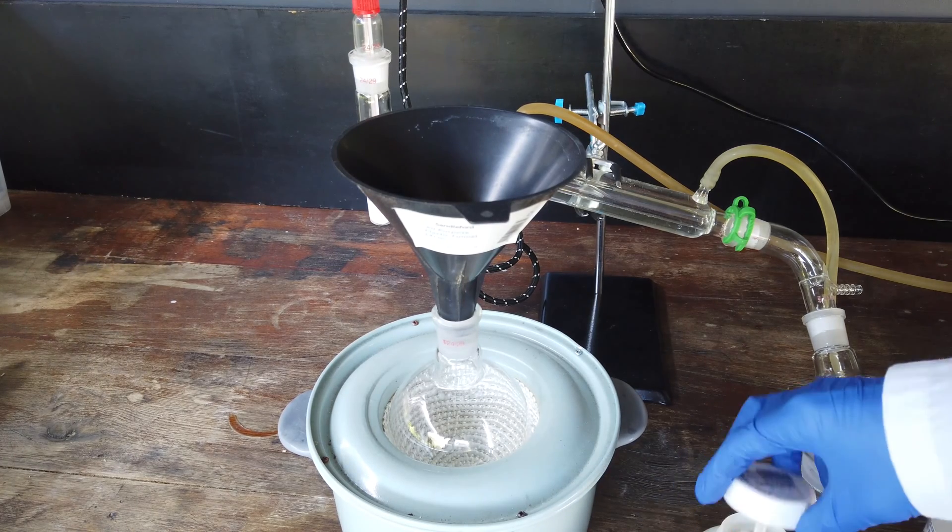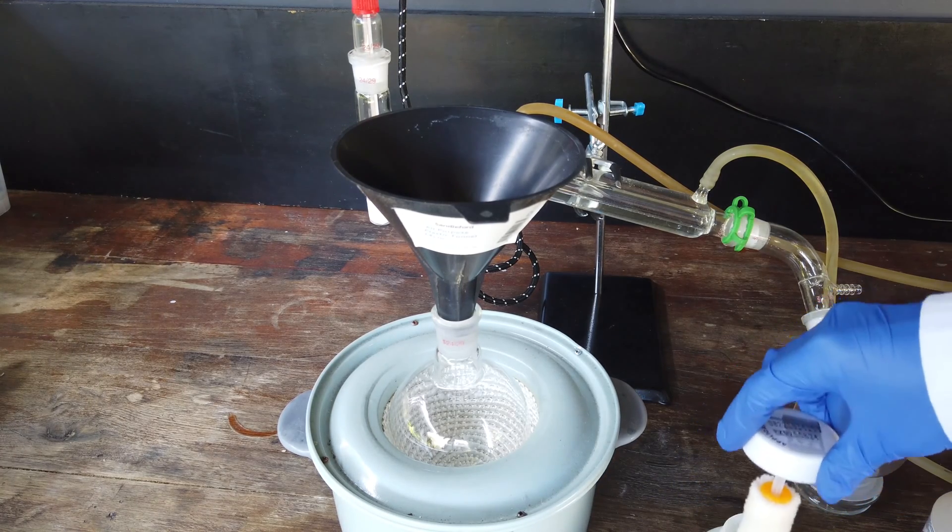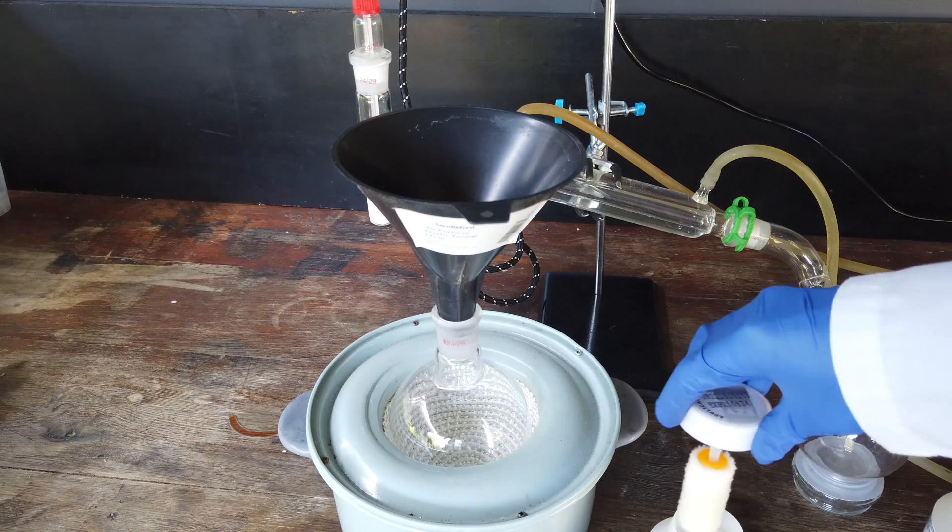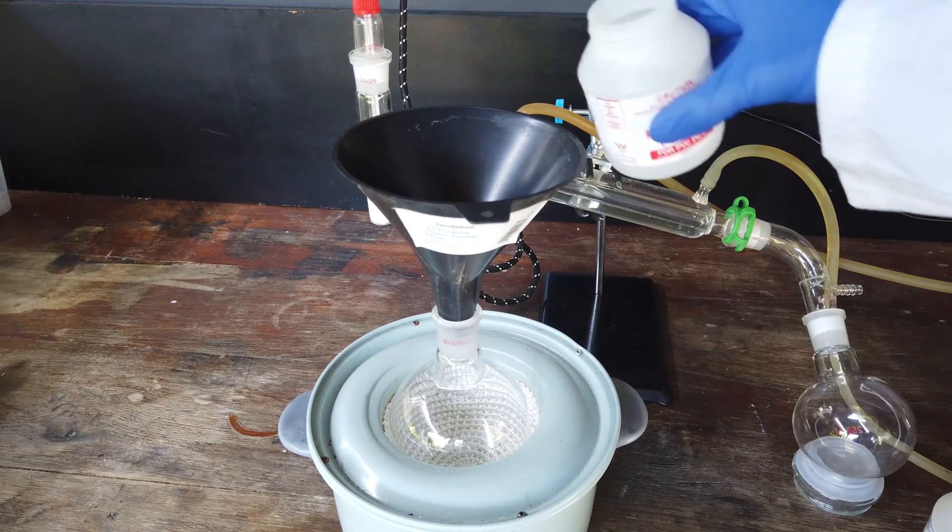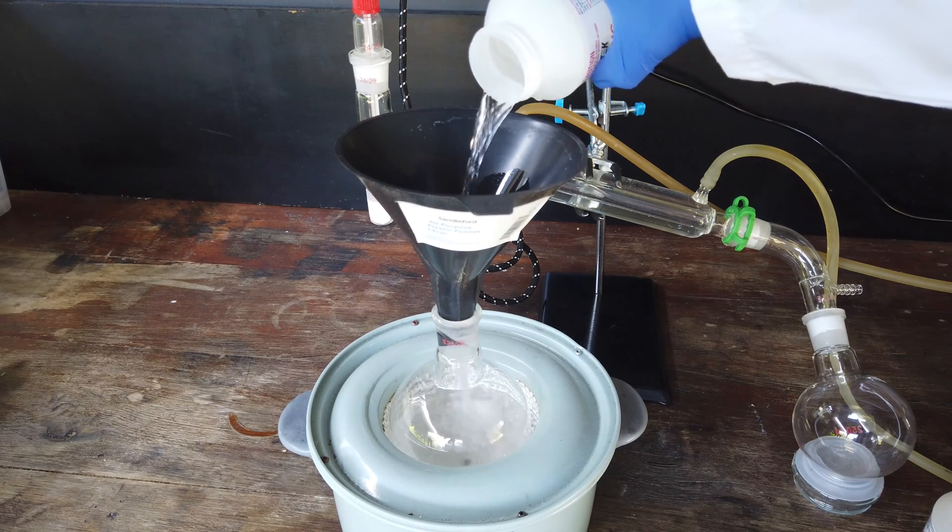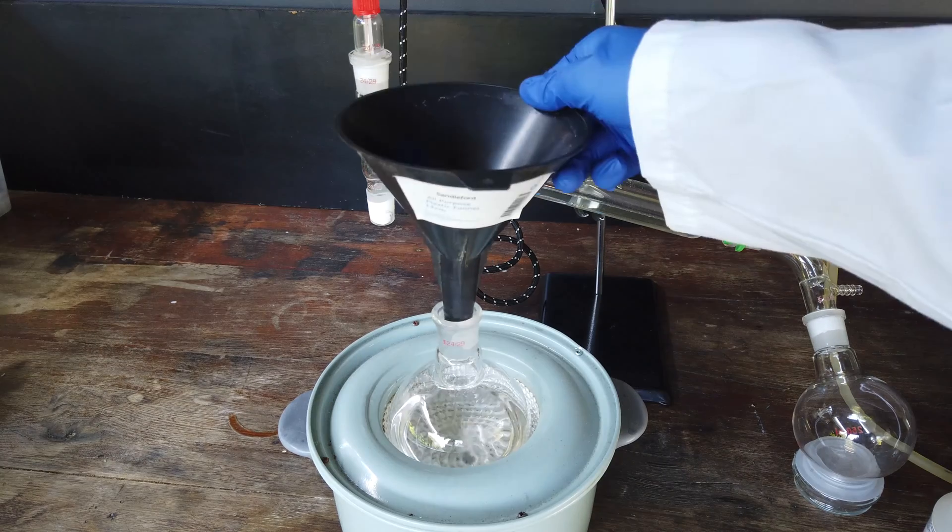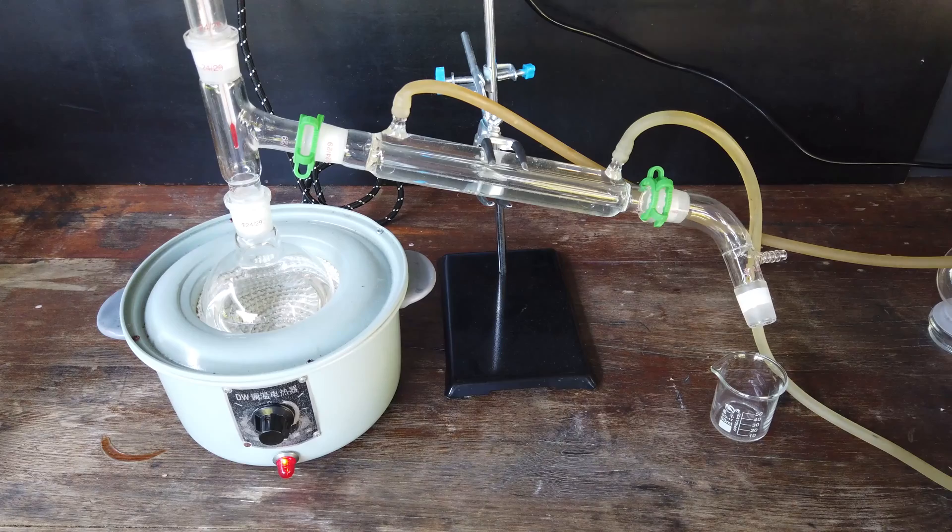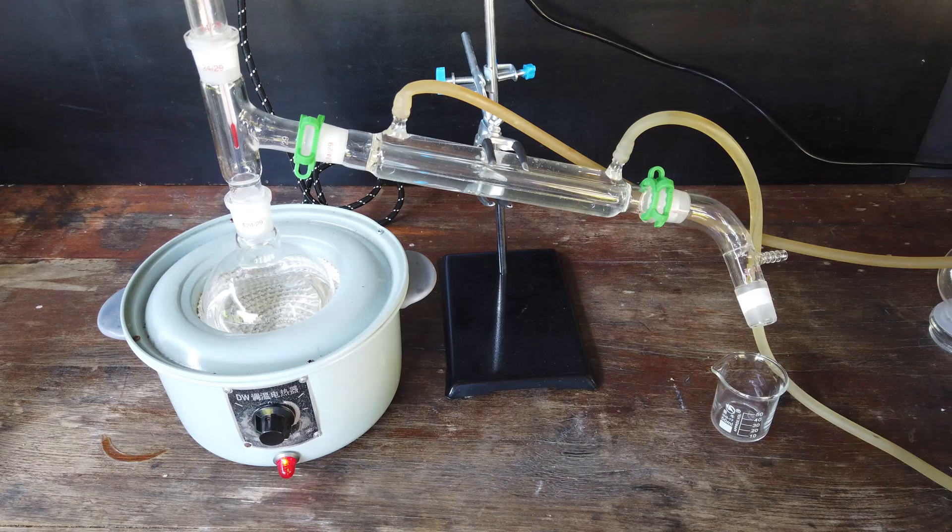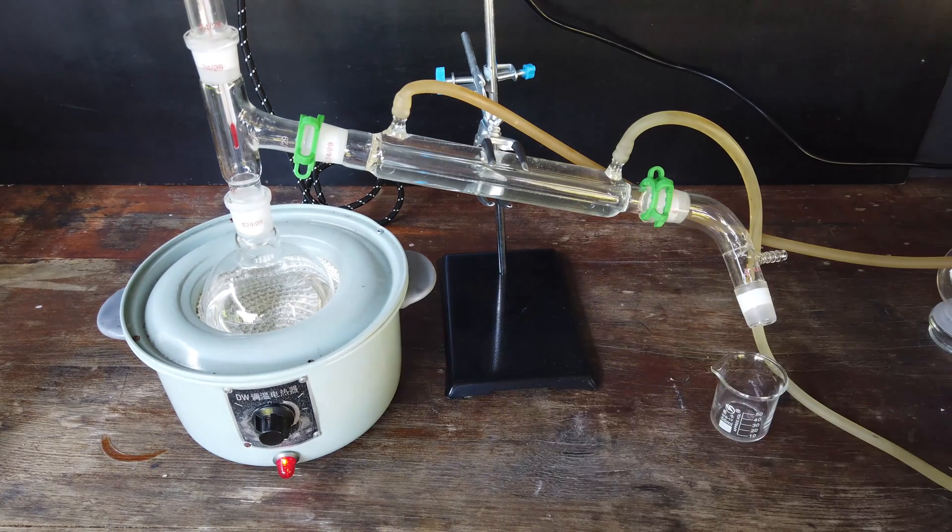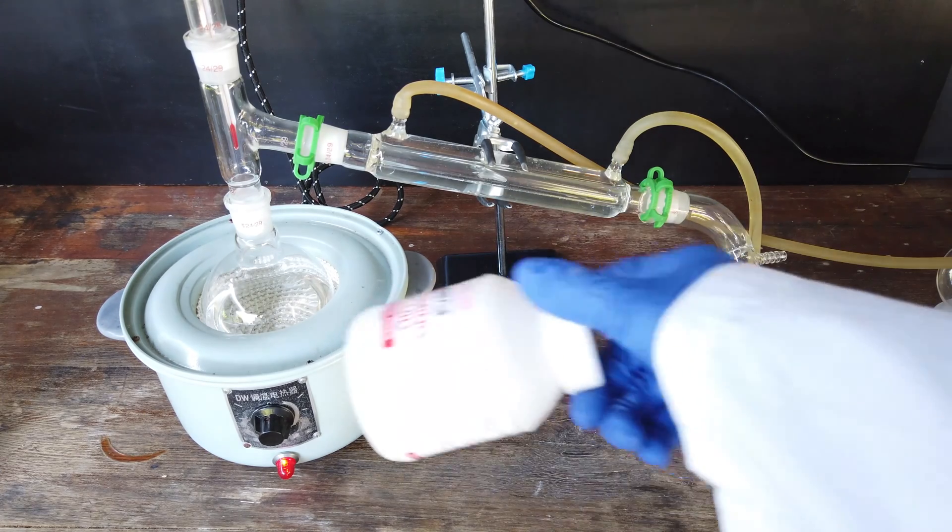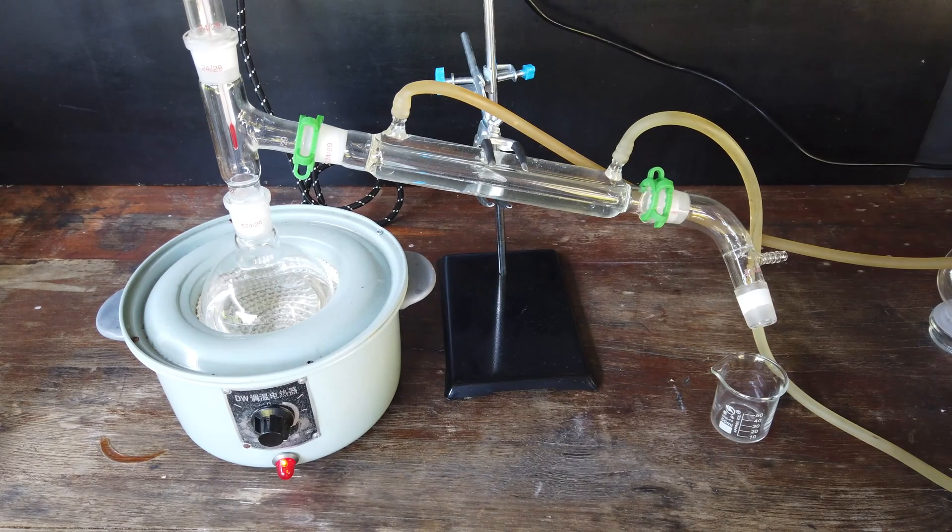First things first, we need to put our methyl ethyl ketone into the boiling flask. The container comes with this application brush, which is a little bit annoying, but we'll cope. Just pouring it straight in. And that's ready to go. I'm going to have to do this in three runs because the size of my current distillation setup only allows for the distillation of around 250 milliliters of solvent at a time. We have three 250 milliliter containers of the solvent, so we're going to need to do this three times.